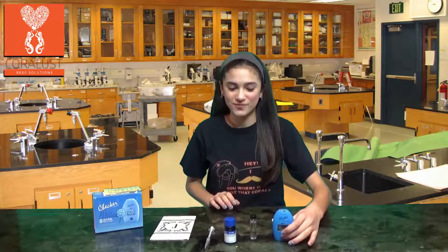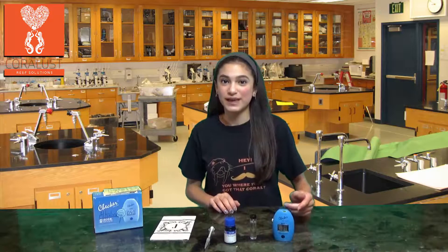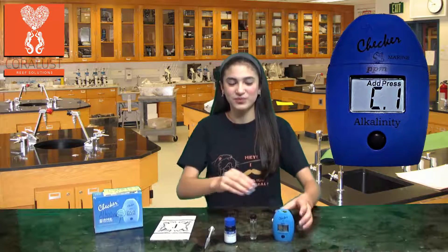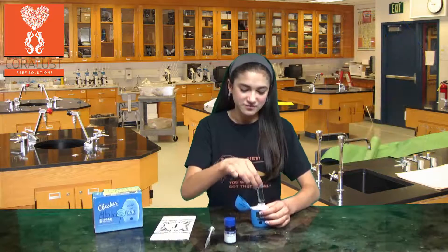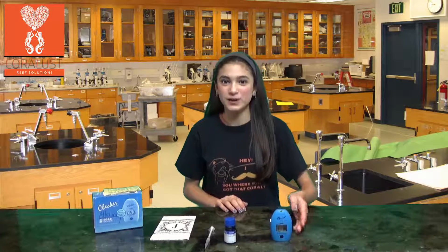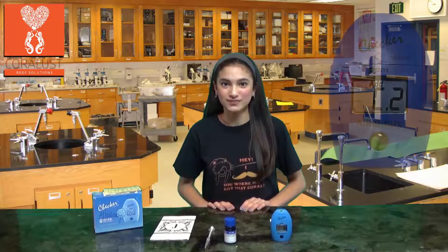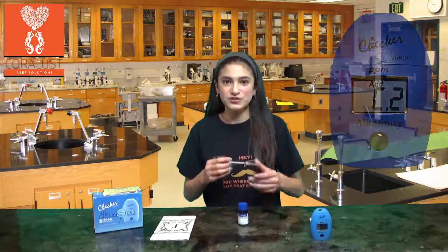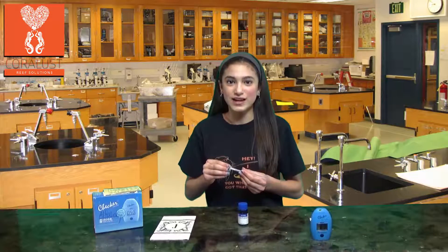Turn your checker on and wait for it to display as C1. Put the vial in, press the button again, and wait for it to display as C2. While we're waiting, fill up your syringe with 1ml of the reagent.